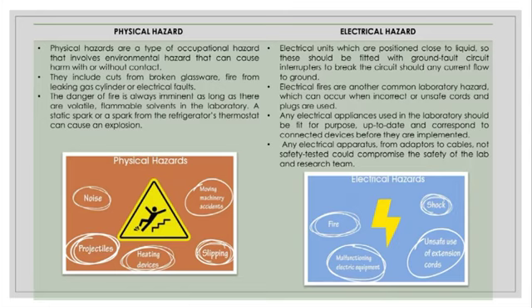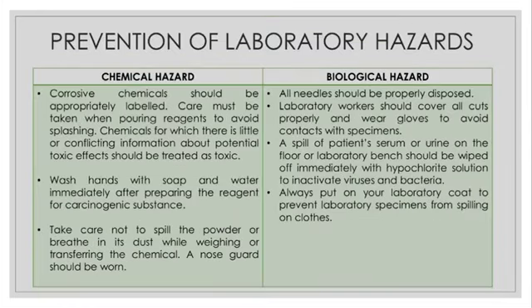Okay, prevention of laboratory hazards. For chemical hazards, corrosive chemicals should be appropriately labeled. Care must be taken when pouring reagents to avoid splashing. Chemicals for which there is little or conflicting information about potential toxic effects should be treated as toxic.